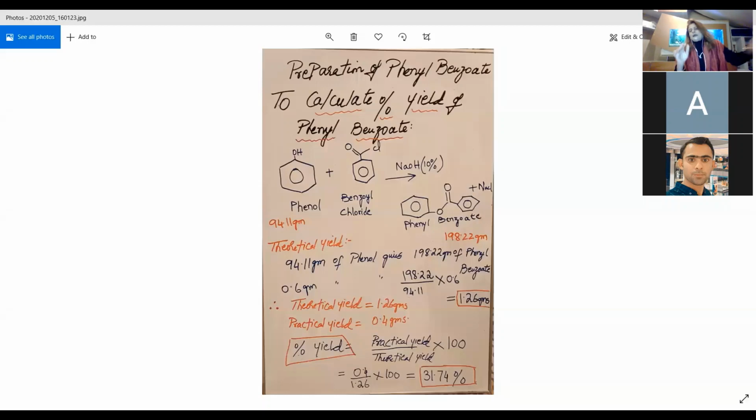Now it may be a little difficult for you, because you don't have your schemes with you. If some of you have schemes, you can compare your scheme with the diagrammatic pathway, and you will see that it is just the same thing, but I am explaining it through diagrams and a number of steps: which glassware you are going to use, how you are going to measure, how to make a solution, how to mix it up, and how to warm. There are a number of steps, and you see here it's the 14th step. You are going to get your final product in the end.